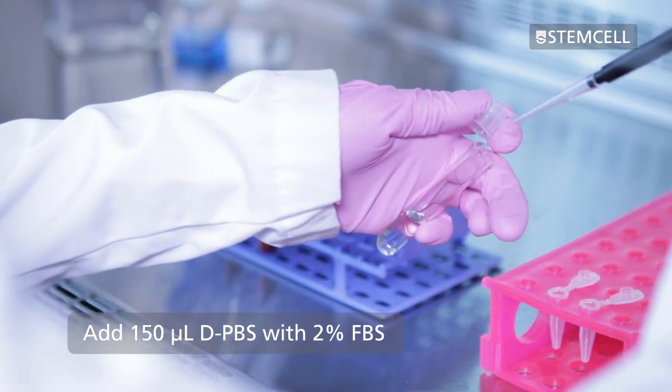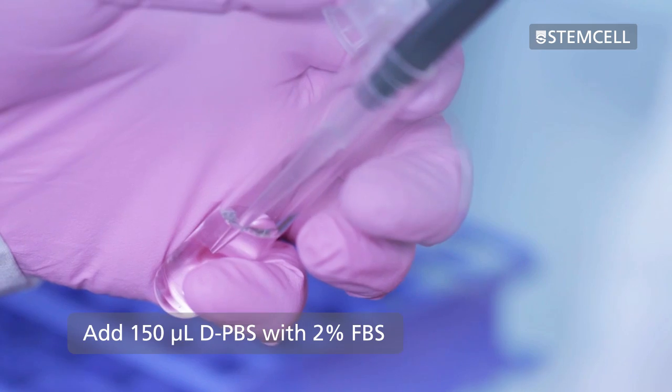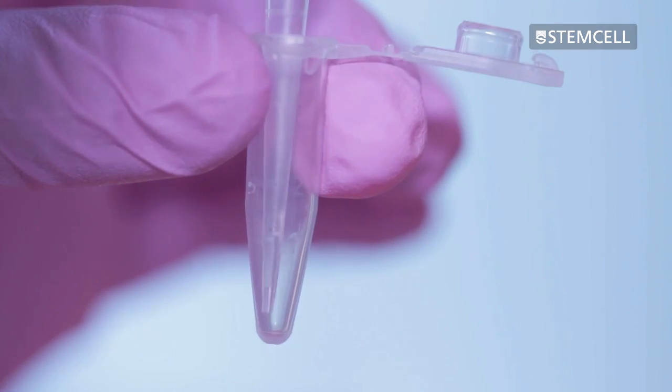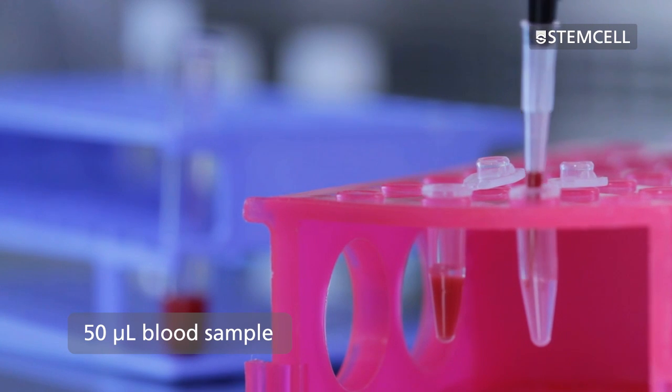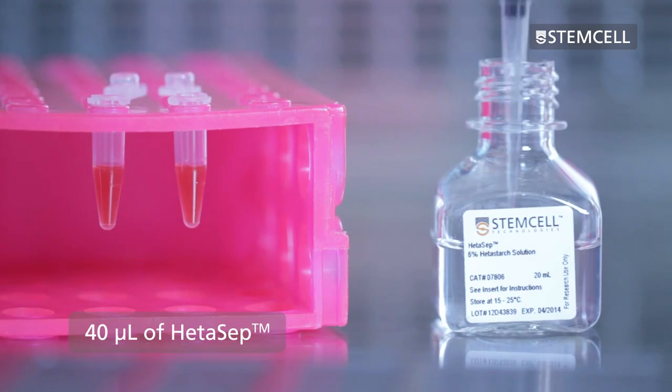Add 150 microliters DPBS with 2% FBS, 50 microliters of blood sample, and 40 microliters of HetaSep.